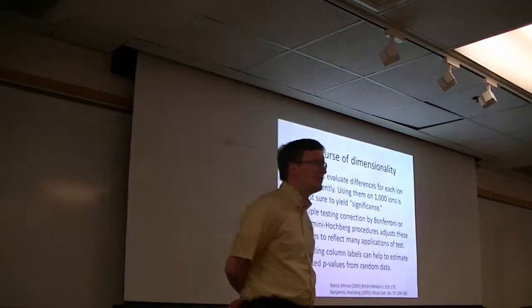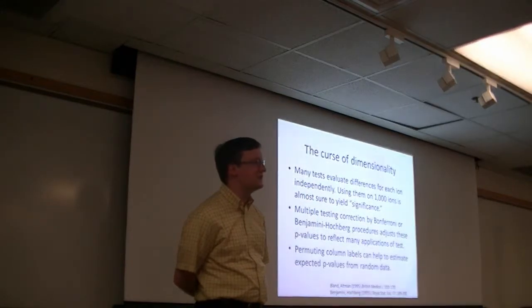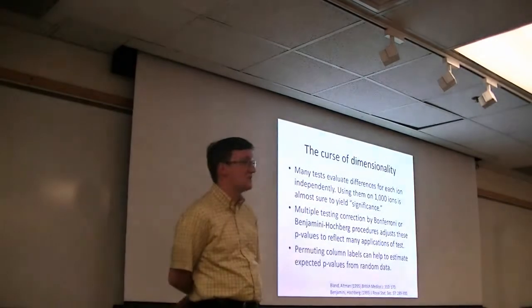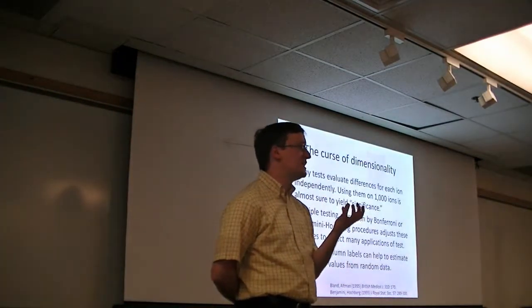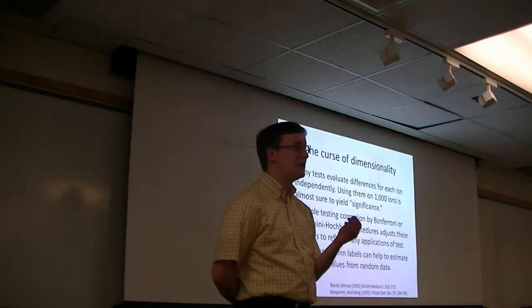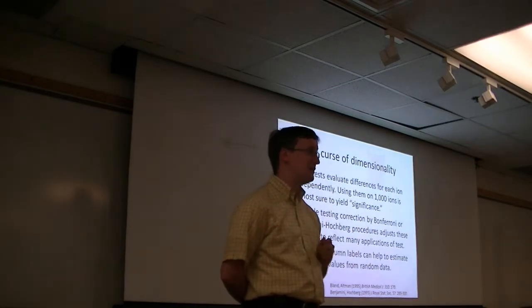That brings us to the problem of the curse of dimensionality. We speak of the curse of dimensionality frequently in systems biology, and the reason for that is that we have many, many tests that we can perform because we're measuring lots of things, but generally with very few replicates.